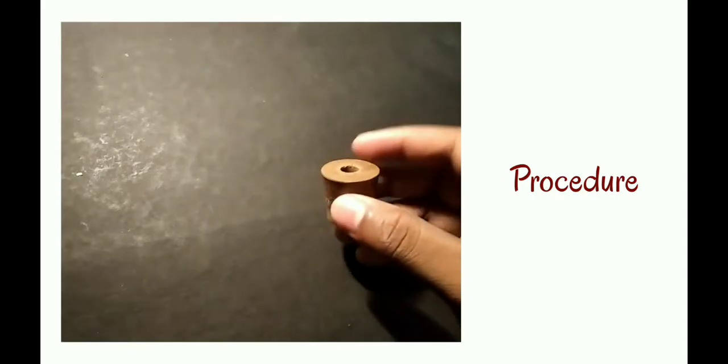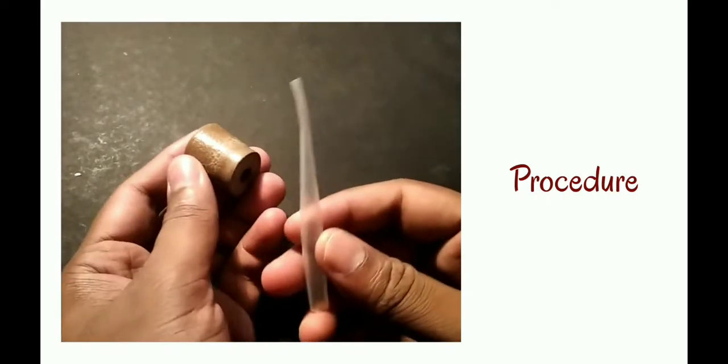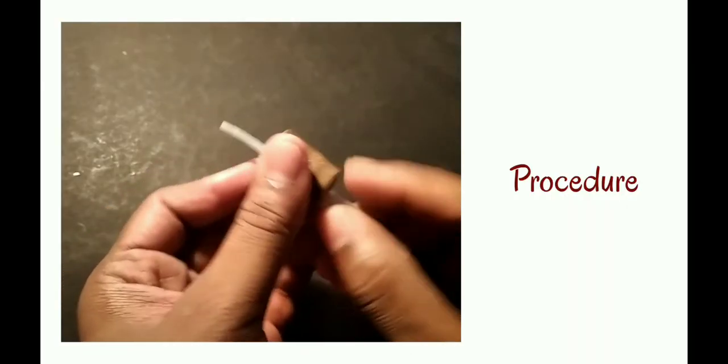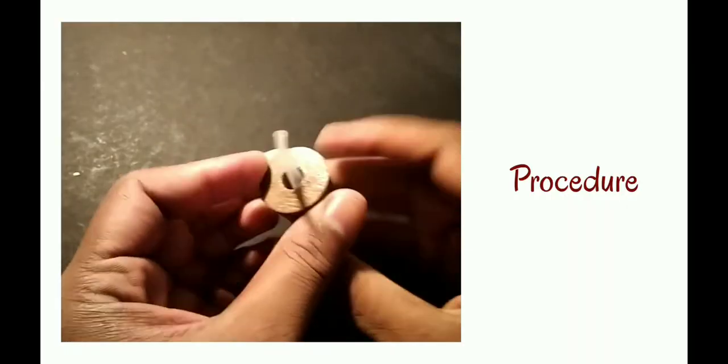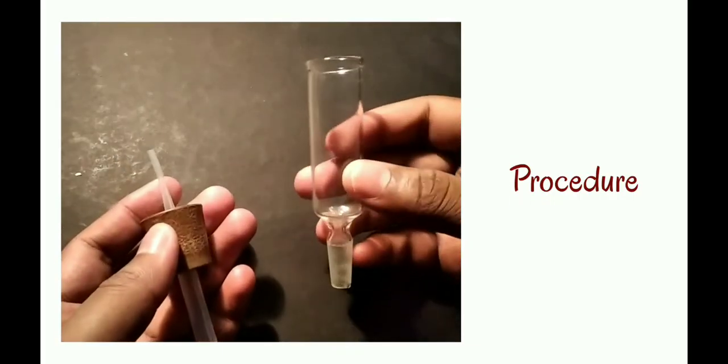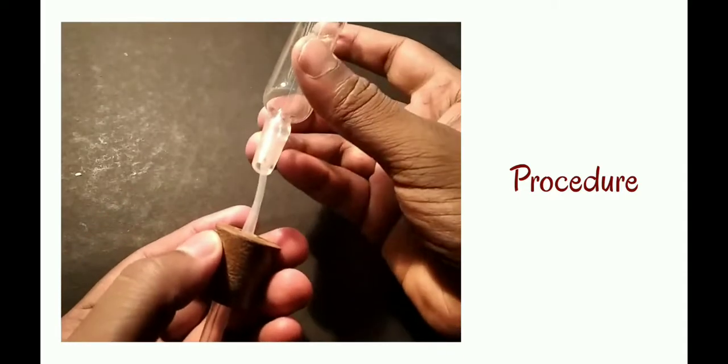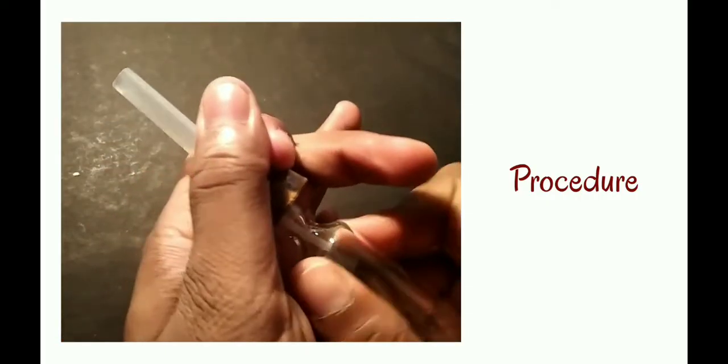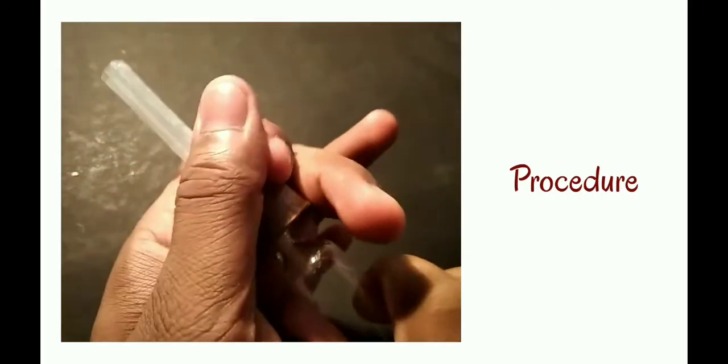Procedure: take the rubber cork and insert the bubbler to the lower portion of the cork like this. Take the water reservoir tube and insert it to the upper portion of the rubber cork. Tightly assemble the apparatus.